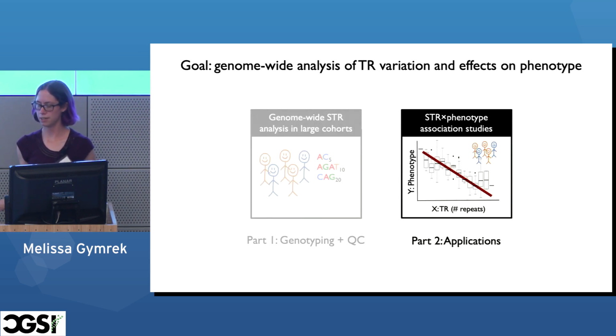But really long, crazy things, we need either other algorithms, like other ones on that list, or we need longer reads. I'm not really talking about long reads, but one of the reasons that we have focused on HipSTR is that it also basically works out of the box on PacBio HiFi reads. In the future, we hope more and more data sets will be generated using long reads, and then that will solve a lot of our problems.